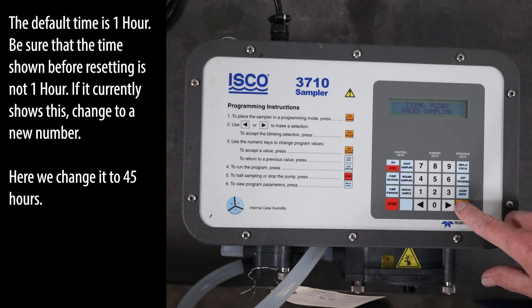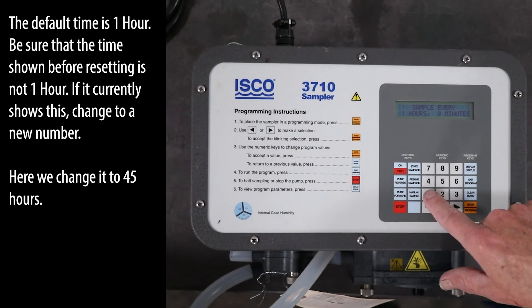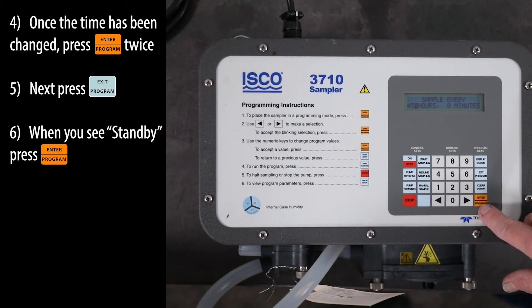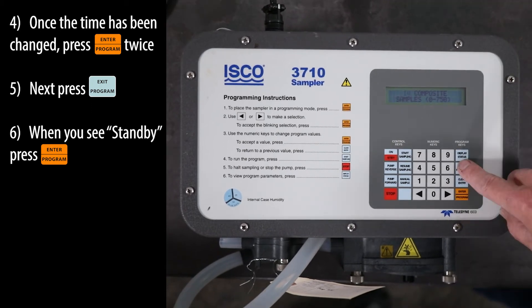Be sure that the time shown before resetting is not one hour. If it currently shows this, change to a new number. Here we change it to 45 hours. Once the time has been changed, press the ENTER program key twice. Next, press the EXIT program key.